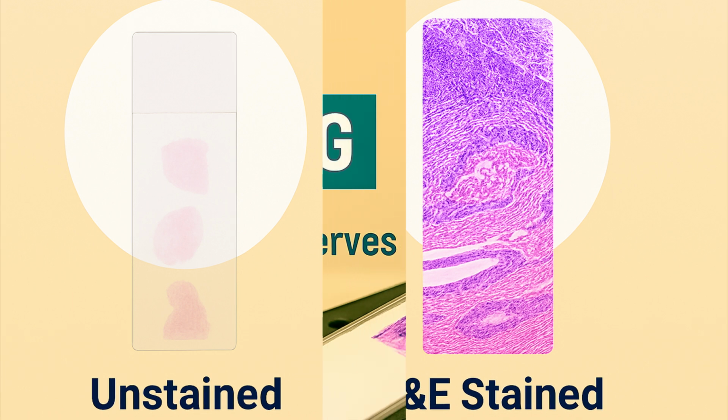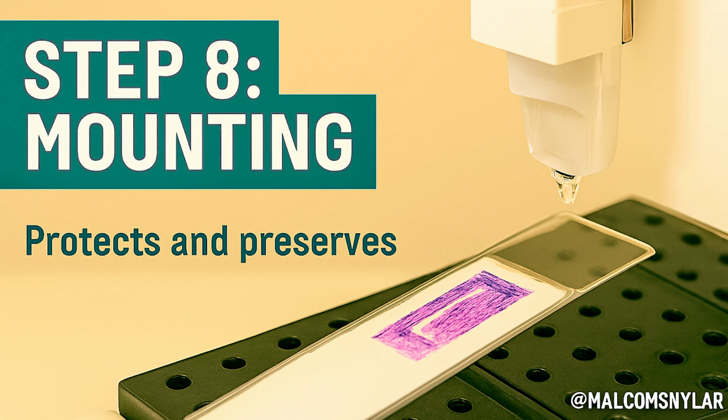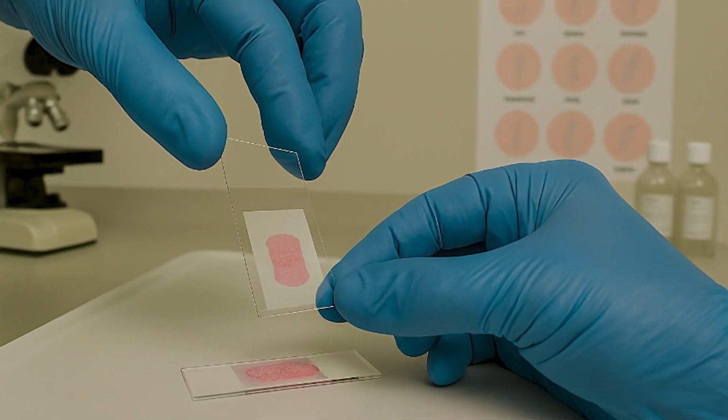Last but not least is mounting. After staining the tissue, slides are mounted with a cover slip using DPX. This protects the tissue and allows for long-term storage. The final slide is then labeled and ready for microscopic review.